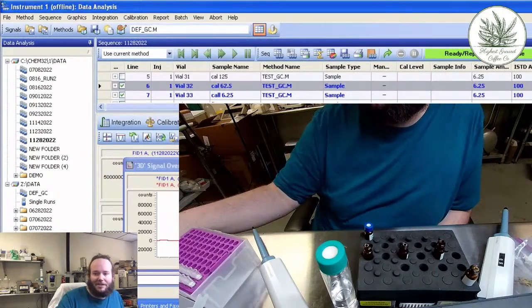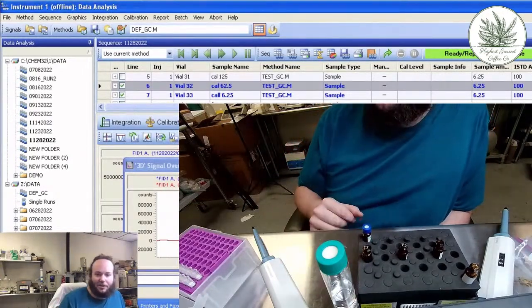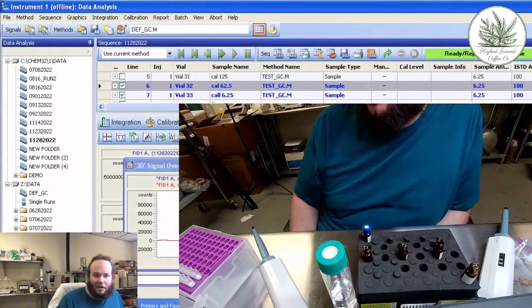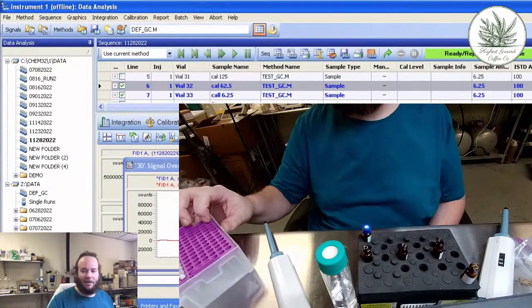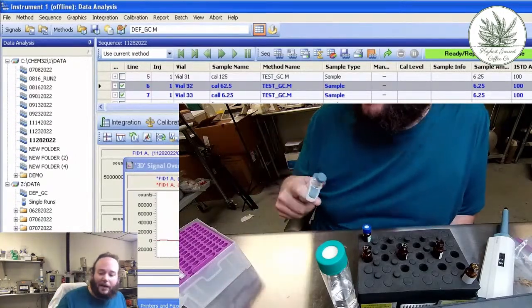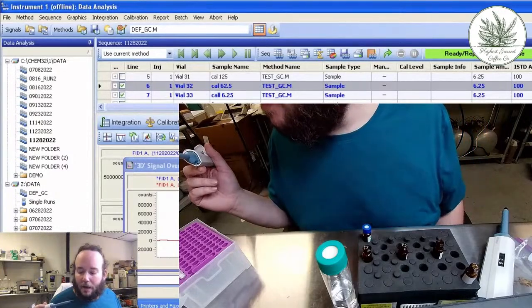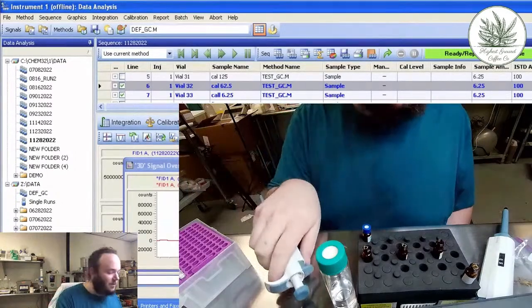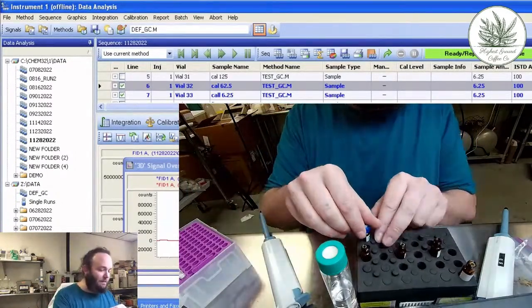Hey, Joshua, good to see you. We're just going to make some calibrations here. And then we're going to toss them up on the GC. So, welcome to hang out with us. By the way, as always, if you guys have questions or whatever, I'd love to answer them. So by all means, please hit me up.